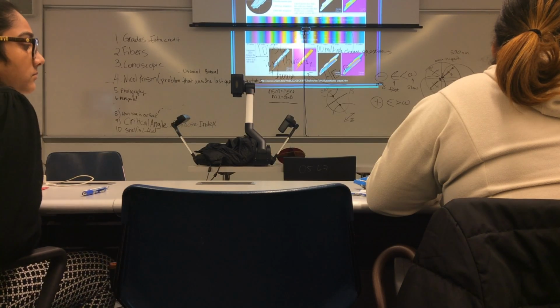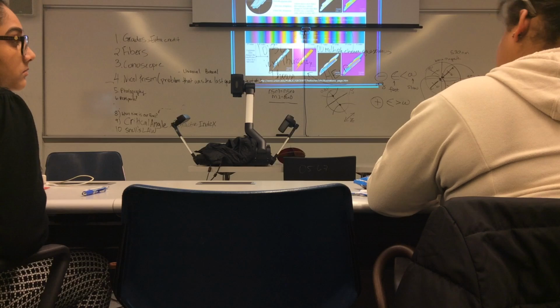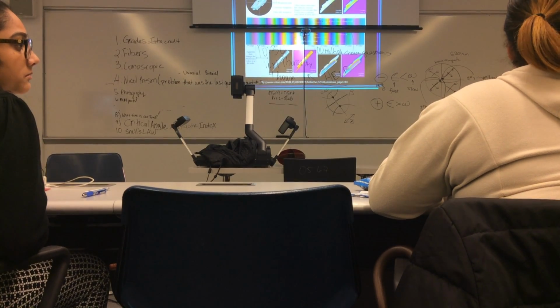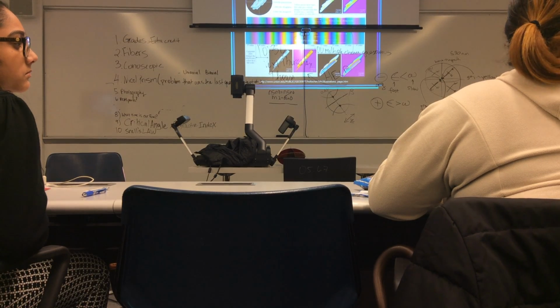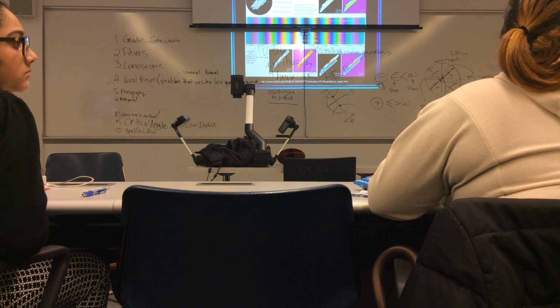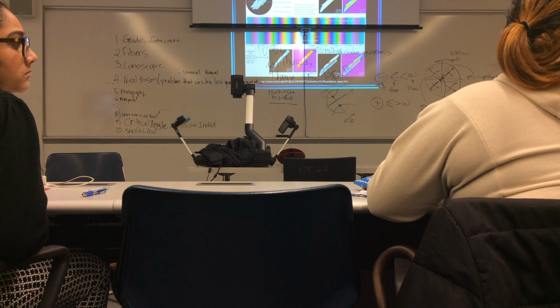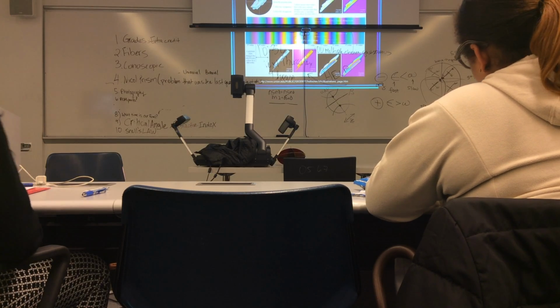So this is positioned on my microscope like this when I'm getting a centered interference figure. And where these optic axes are emerging, that's where the melotopes are, and I'm going to have brushes like that, on either side.